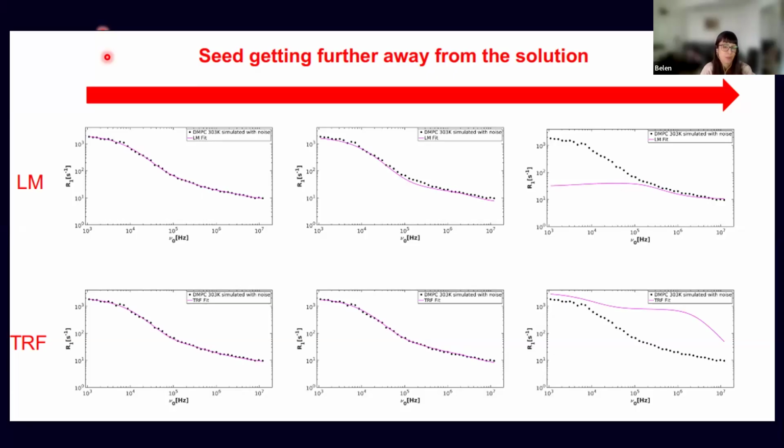But unfortunately, DIRMIN failed to find a unique solution after 10 days of running on a computing cluster because it requires a large number of function evaluations and significant memory, which scale rapidly with the number of variables. Because the method was impractically slow, we decided to try a local minimizer, which gave us excellent results.